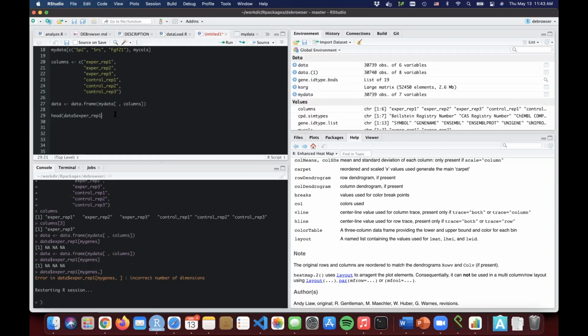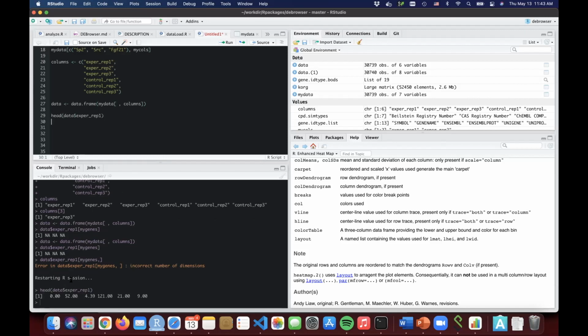They're also upgrading these things and changing the functionalities. Sometimes you do something, it works. That's why I was talking about this. Yeah, these are here, but then the names are not here. Sorry. I lost the naming when I just get one column. See, it doesn't know which gene this is. So when you just reach one column like this, it's not going to work.